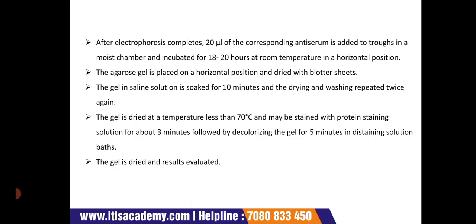The gel is soaked in saline solution for 10 minutes, and the drying and washing are repeated twice again, so you do these two steps two times.